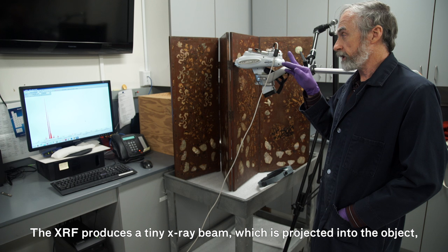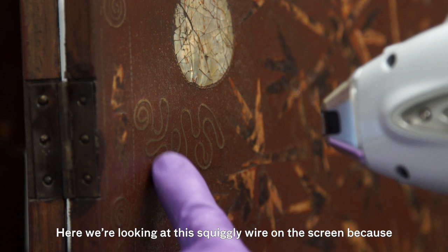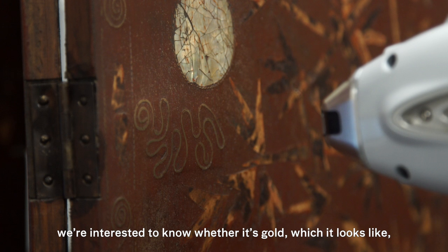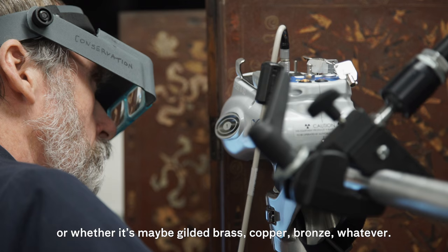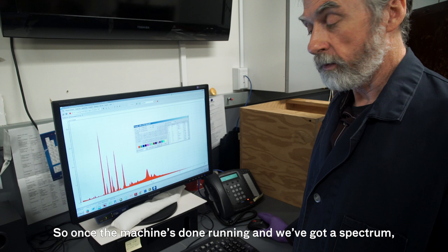The XRF produces a tiny x-ray beam, which is projected into the object, and when it encounters the electrons around all the atoms, those electrons release little bits of energy which the XRF can detect and count. Here we're looking at this squiggly wire on the screen because we're interested to know whether it's gold, which it looks like, or whether it's gilded, brass, copper, bronze, or whatever.